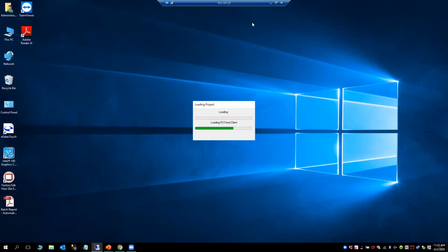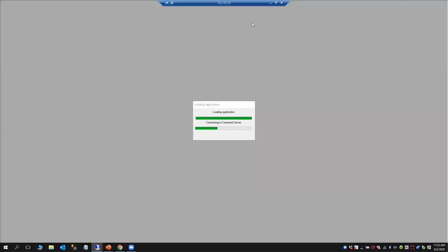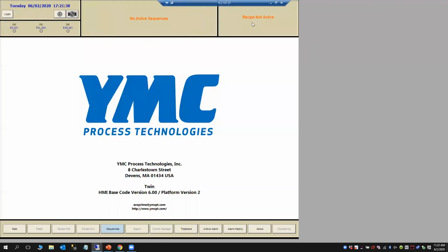The development stage allows for a developer, for the administrator, to be able to update the recipes on an as-needed basis. Production allows for an operator to come in and initiate and start the recipes. And archiving of the recipes allows for the possibility to keep track of what has been done in the database that you could always come back to as needed. So here is our application that has been loaded back up.